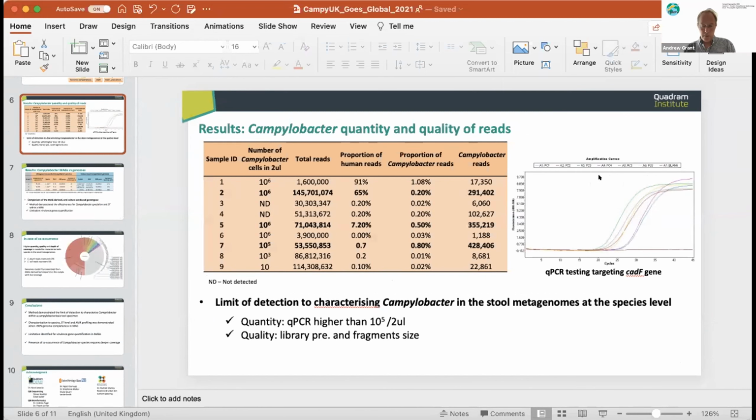Okay, so there's a follow-up question from Alda about different sequencing approaches. There's also been a question on how you deal with plasmids with your MAGs. Quite a few Campylobacter have plasmids. How do you deal with those? So for this study, for now, we were only interested to know the sequence type using MLST, the species definition and the genome completeness. Further analysis will be done later to do more in silico analysis. So for now, I focused only on the MLST, AMR profiles, and the species.